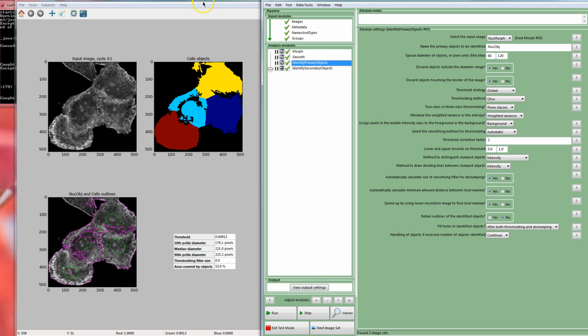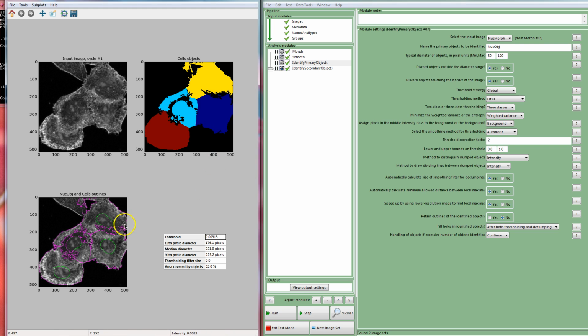It will save me many hours, I feel. So we've separated out reasonably well here. This one I've thrown in what's called a little bit of a curveball. Not a term I used much until I moved here. And it's not going to grab these two bits so well because we don't have a starting point. It does really well when we have a middle point here. It's going to work away from the middle point.